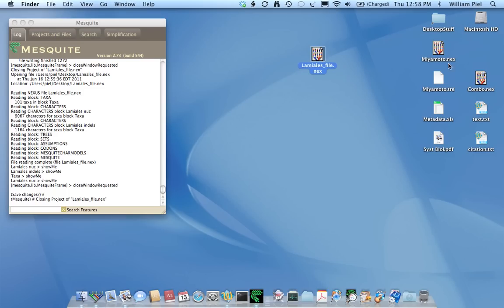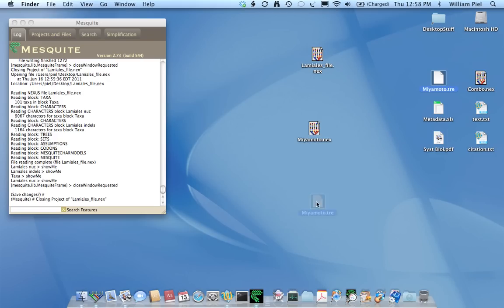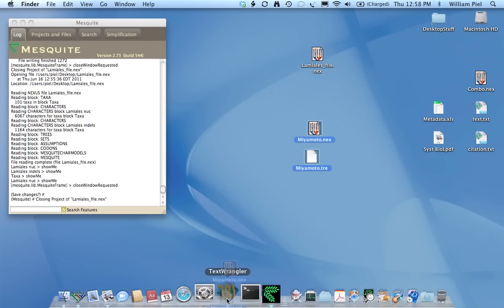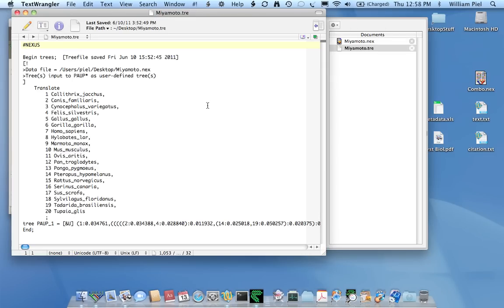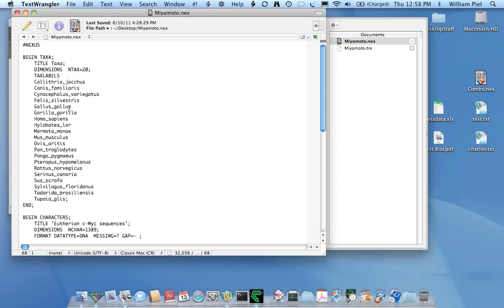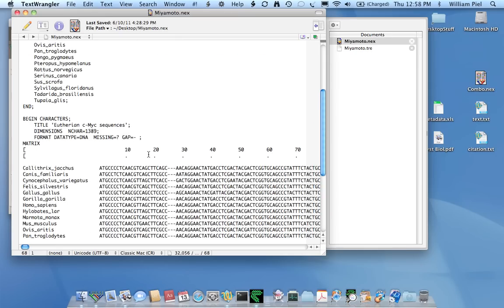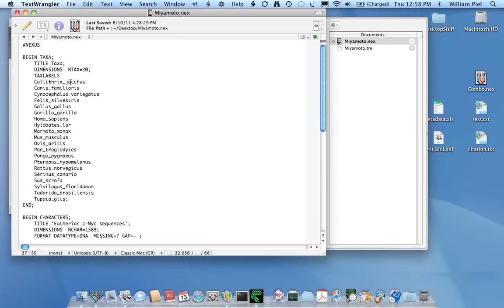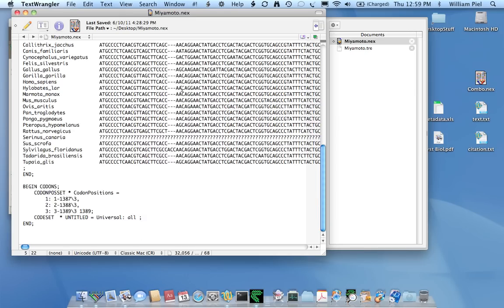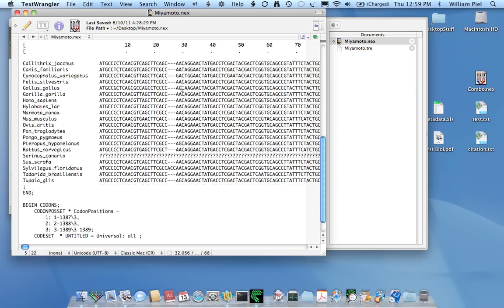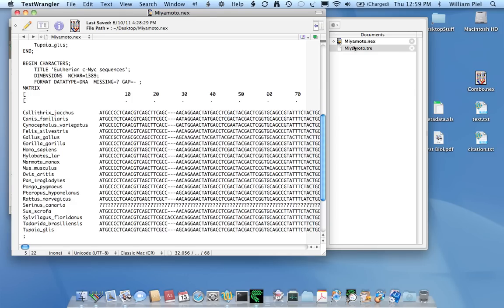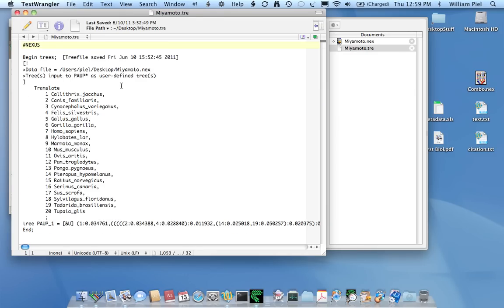So for example, let's take a look at this nexus file and this tree file. I'll open it in a text editor, text wrangler. You can see that the matrix is a set of DNA sequences with 20 taxa. And the tree file also has 20 taxa, but is saved separately. And this was saved by PAUP, as you can see.